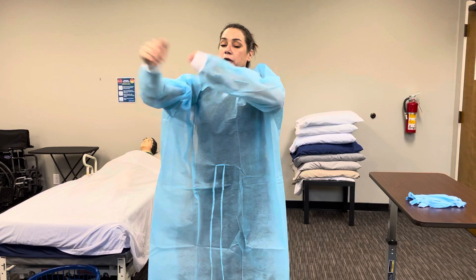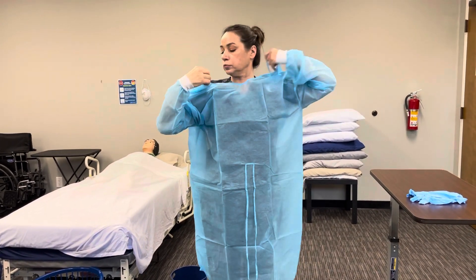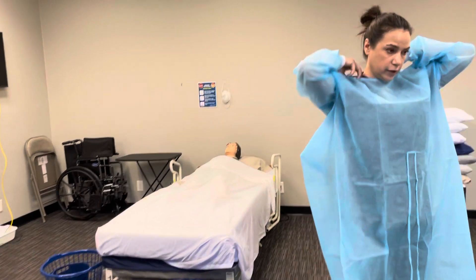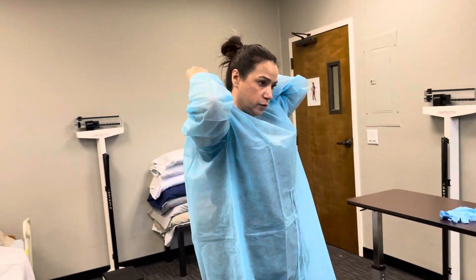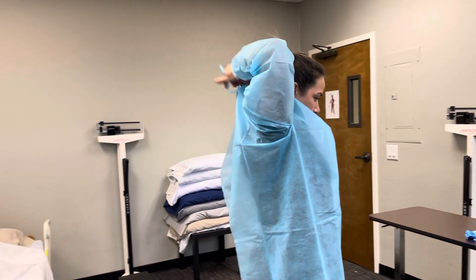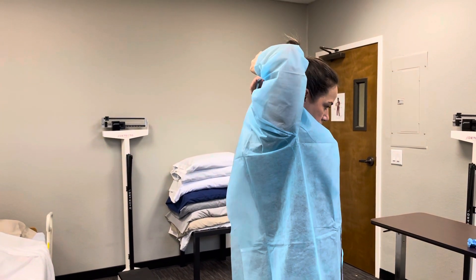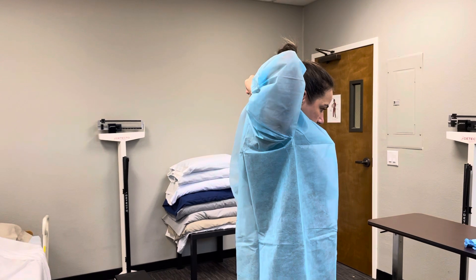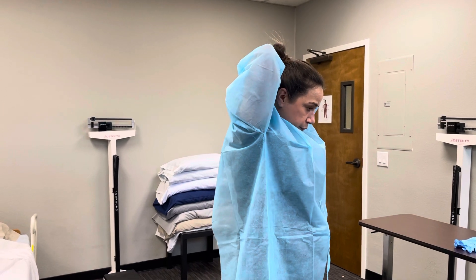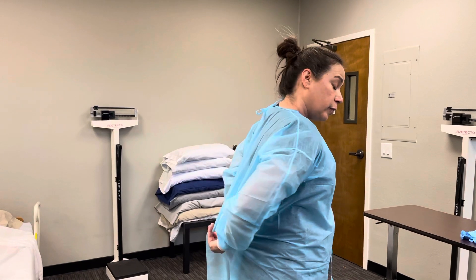Then we are going to put on our gown and we're just going to tie it in a bow so it's easy for us to untie to remove. I'm going to tie it, trying to cover up as much of the back as possible.